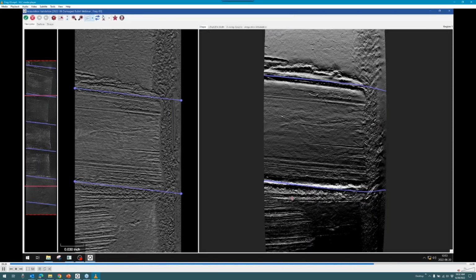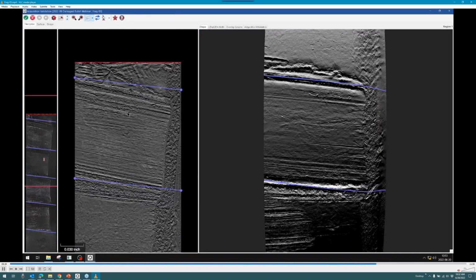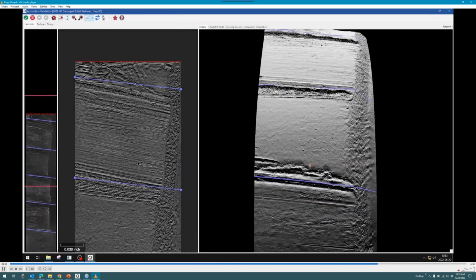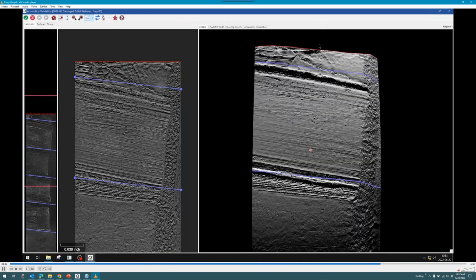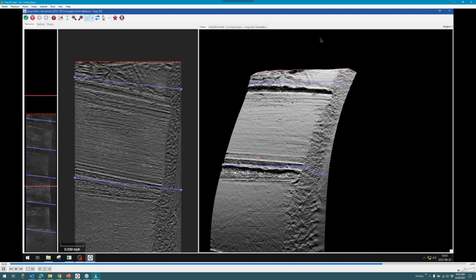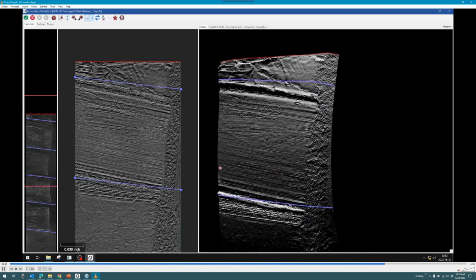Quick glimpse at the workspace there. We can see our progress. Fragment 1 was acquired, Fragment 2 was acquired, Fragment 3 is being validated right now. And this is the same process as before, so we've seen this already. The light right now on the shape here, there's a virtual side light shining down, and it is actually casting a shadow. I have it angled so that it casts a shadow down the ramp of the shoulder here, where it transitions from the high groove engraved area to the low land engraved area. I know that the anchor line needs to go right underneath that shadow.